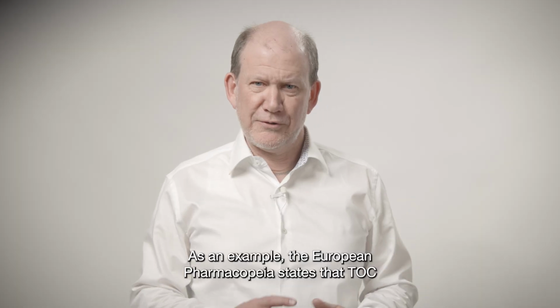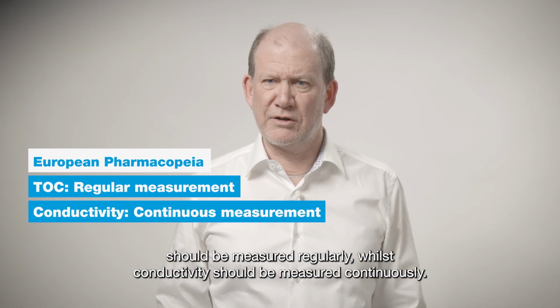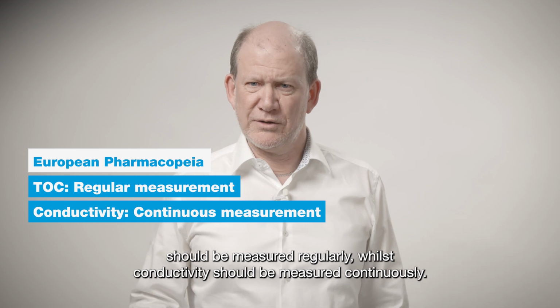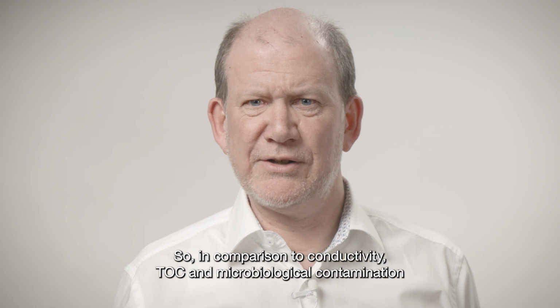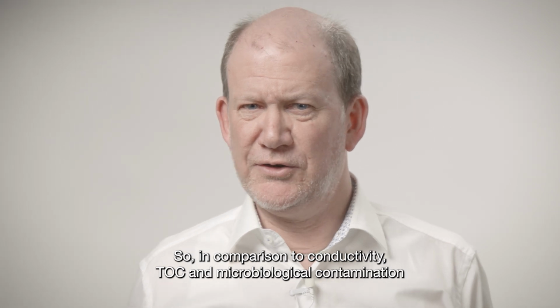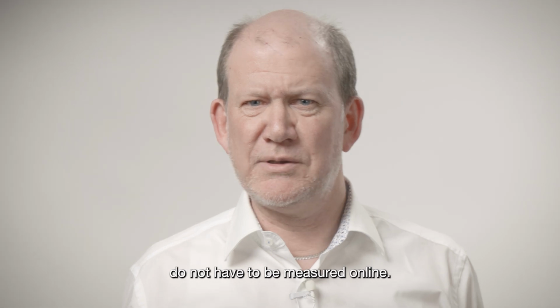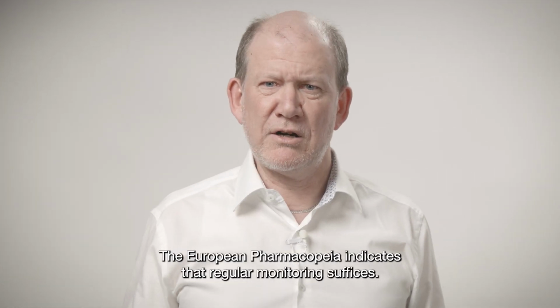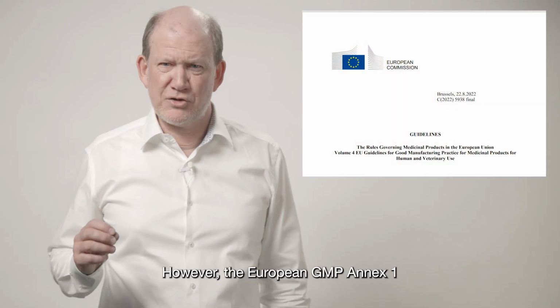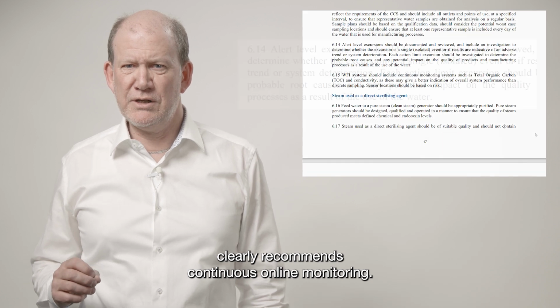As an example, the European Pharmacopeia states that TOC should be measured regularly, whilst conductivity should be measured continuously. So, in comparison to conductivity, TOC and microbiological contamination do not have to be measured online. The European Pharmacopeia indicates that regular monitoring suffices. However, the European GMP Annex 1 clearly recommends continuous online monitoring.